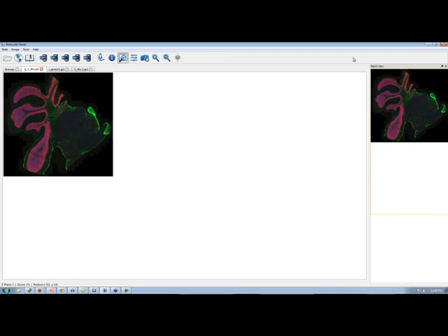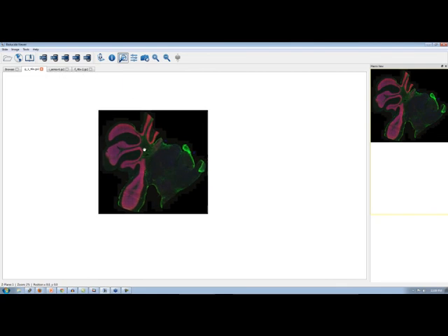Jeff, now, when you say zooming here, you're referring to changing the magnification of the current image plane, right? You're always on the same focal plane, and we're not talking about going from one focal plane down to another. Exactly. So if you were looking at a stack here, you would not be focusing through the stack. You'll just be zooming in and out of a single focal plane, akin to changing a lens on a microscope. Sure, you're basically just going from 10x to 20x. Yep, exactly. Now, so let's take a look at zooming.